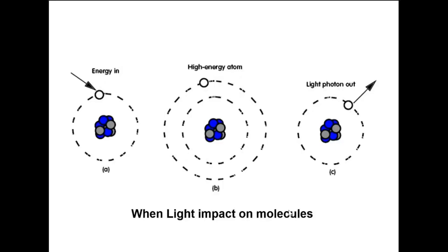So when light of a particular wavelength interacts with matter, what is actually happening? If you take any biological material, that biological molecule is considered as matter as of now. When the light interacts with this biological molecule, with this matter, it is considered to be a quantum phenomenon.